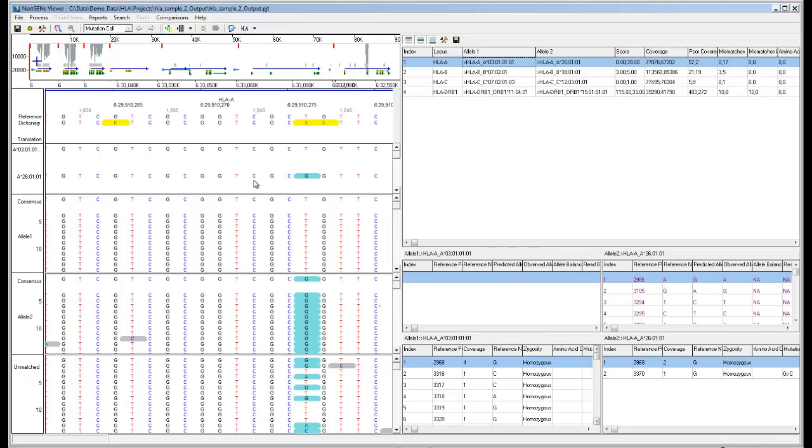Next is the Top Allele Pair Matches pane, which shows the dictionary sequence for the alleles best matched to the sample data, with the allele name shown on the left.